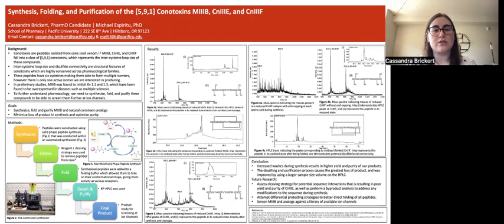Our resin always had a starter amino acid on it with a protecting group. On the image, you see BOC on the end of the compound. We actually used one called FMOC, but the role of this is to keep the amine from reacting until we want it to, in order to form the correct sequence of amino acids. The deprotection step you see there is to remove those protecting groups.